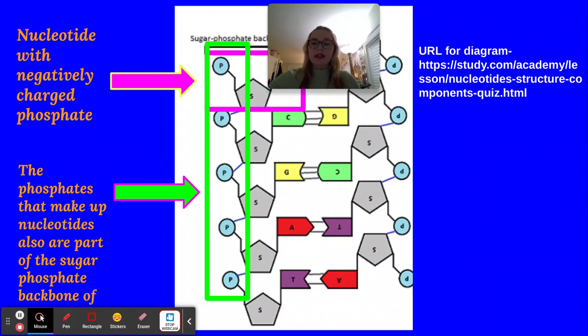To analyze a DNA sample, a restriction enzyme is used. This is what cuts the DNA up into pieces in specific places. This can be used when determining a relationship between a parent and a child.